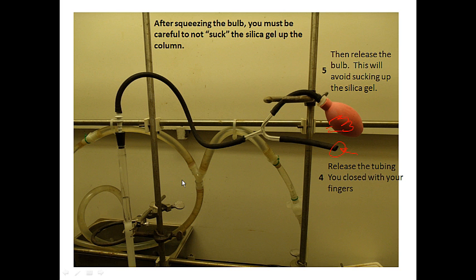And if you do this, you'll be able to push the solvent through at a little bit faster rate than sometimes the solvent will flow with gravity. Okay, and so you will probably have to do that at some point during the experiment in order to be able to finish. So it's important that somebody do this and that they don't suck the solution back up and break our column that we worked so hard to make. Okay, so that's our pre-lab lecture for experiment 8, the column chromatography experiment.